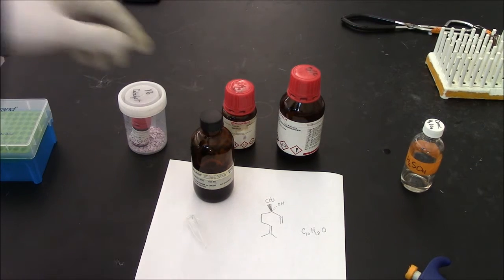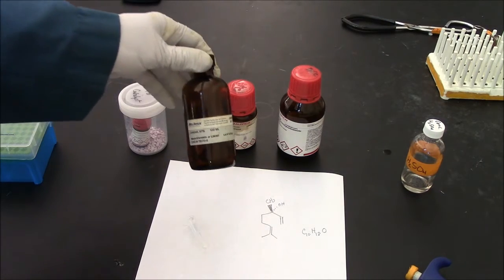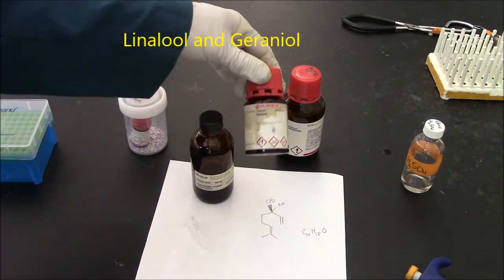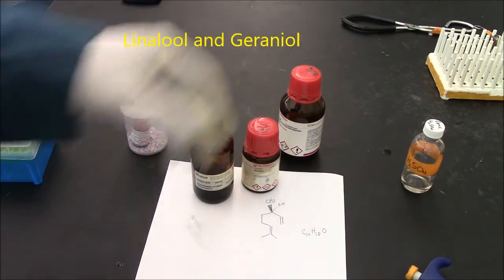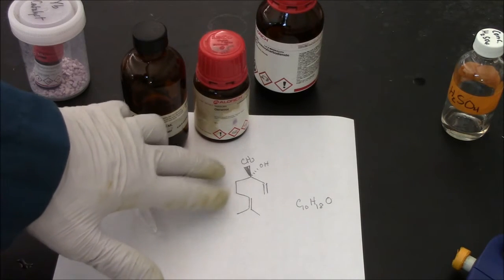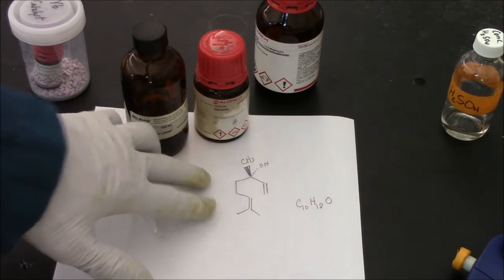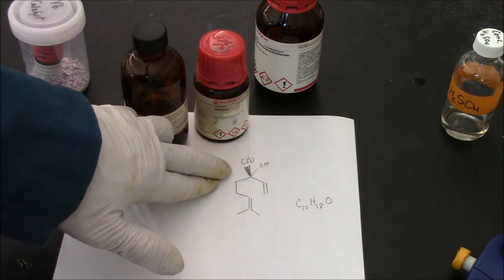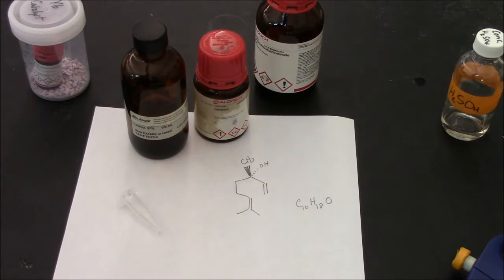I have two alcohols that you can use for the second ester. This is Linalool here, and this is Geraniol here. Both come from plants. These alcohols have complicated structures, unlike ethanol or methanol. And what makes them challenging to work with is that this alcohol is unstable when exposed to a strong acid.